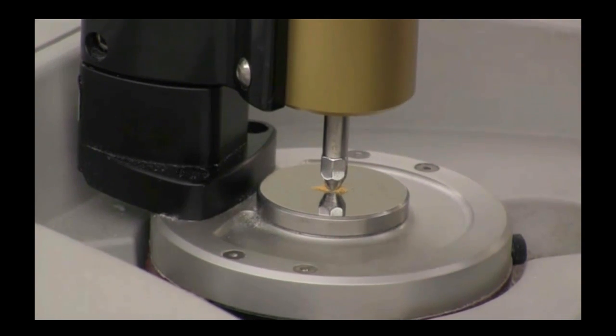In the case of this experiment, the IR radiation is coming from below. The IR light passes through the diamond, reflects around inside the diamond, and at the surface of the diamond where the sample is being pressed up against it, the IR radiation becomes attenuated. The light reflects back down, goes to the detector of the IR spectrometer, and so we're looking at how the beam is attenuated by the fact that there is sample on the surface of the diamond. You can also use this with liquids, and we do use this with liquids in the undergraduate teaching labs at Northwestern. In that case you would just put a single drop of your liquid sample on the diamond surface and lower the anvil to trap the drop so that it doesn't evaporate and then go ahead and collect your spectrum.